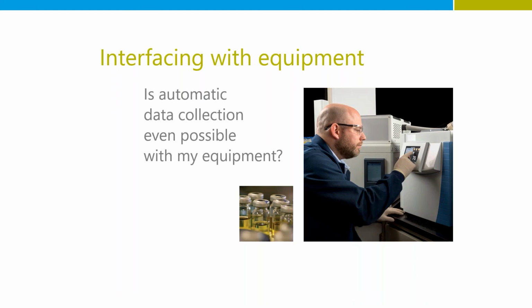Another capability which I've seen a lot is the machine to file interface. So a machine will do the testing of the samples, and then it will generate a file in a CSV or some sort of custom format to be placed in a file folder somewhere that then can be picked up by a custom process you have or might need to build that will interface with the rest of your downstream processes and systems, such as your LIMS system in which you continue the process forward.